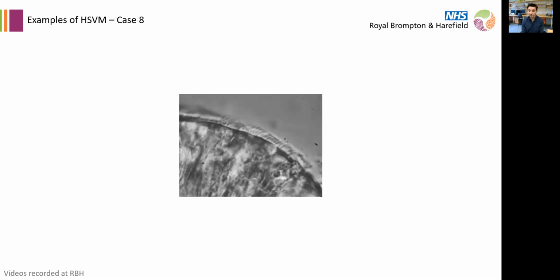Any idea? Someone says stiff, reduced amplitude. Yeah, so this is also pretty reduced. And if we look at this area, it also looks really fast. And I think it's actually fair to think that, because it was a DNAH11 mutation, which is a mutation that we talked about earlier in the lecture, saying that they are somewhat of a high frequency, reduced amplitude, and you would lose that pattern if you were to look at it at too cold of a temperature.